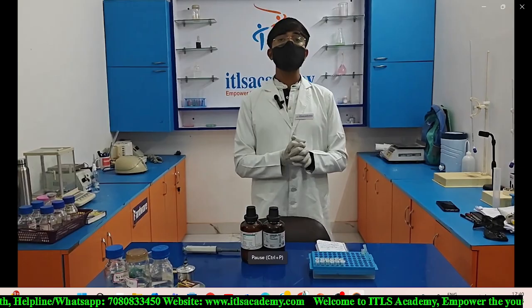As I already set the micropipette to 100 microliter, now I am going to add this amount in each of the eppendorfs. We need to make sure that we pour this amount very carefully in each of the eppendorfs, and after that I am going to add 200 microliter of chilled ethanol in each of the eppendorfs.